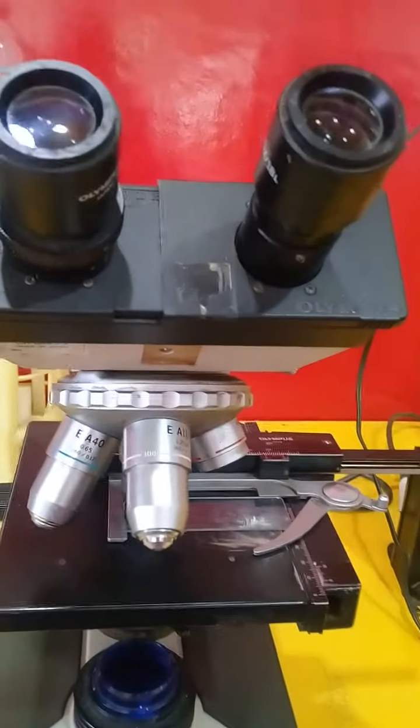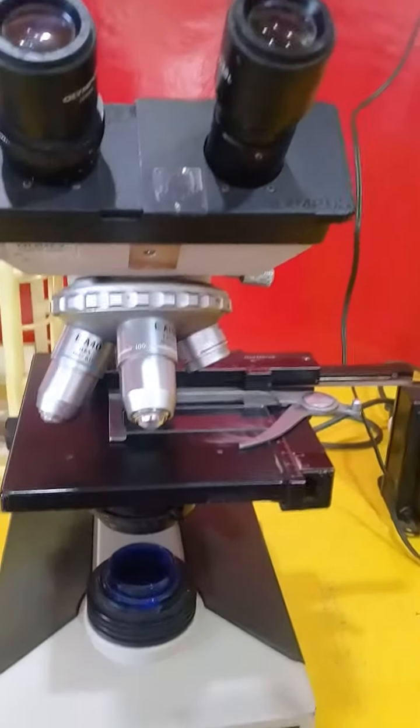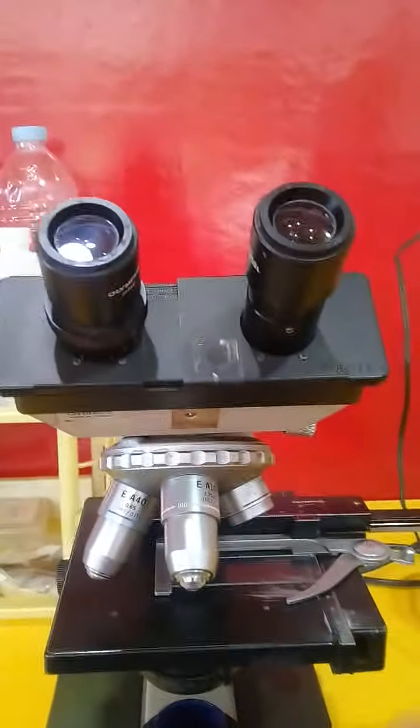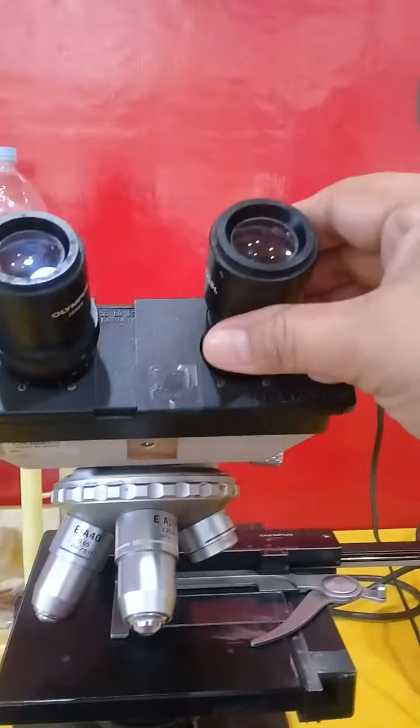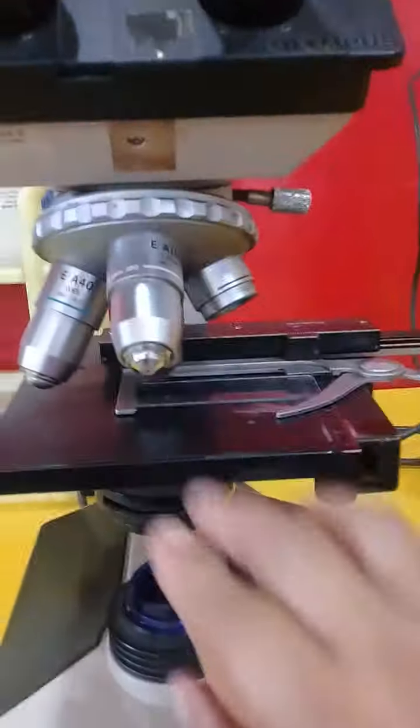Hi, good morning everyone. I'm going to introduce you to the microscope. This is a microscope. This is the ocular eyepiece where you can see the specimen that you put here.